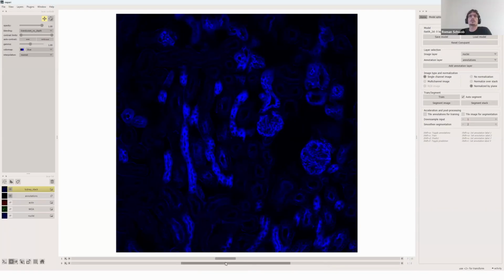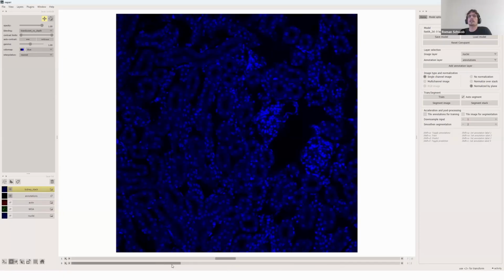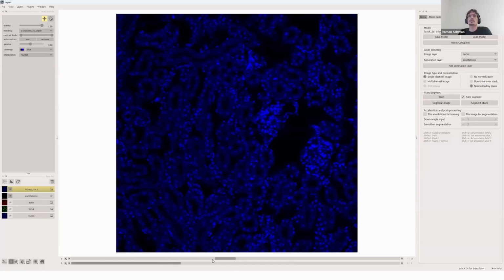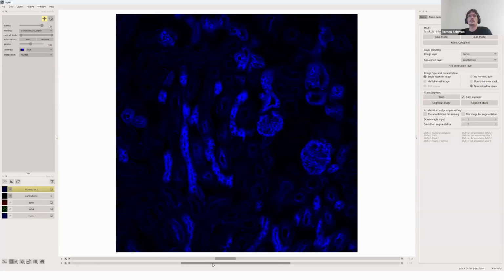That's why it just shows everything in blue, but you can slide across the different channels. But I think you probably agree with me that this is much harder to actually look at and know what you're looking at than the thing that we had before.